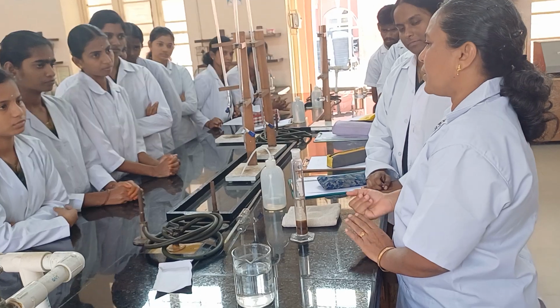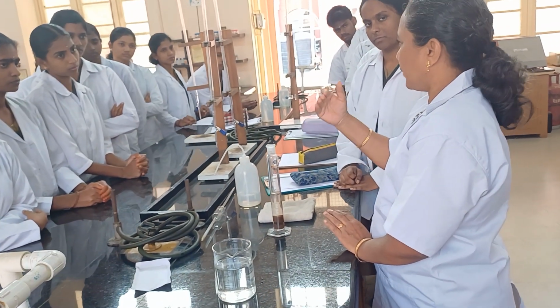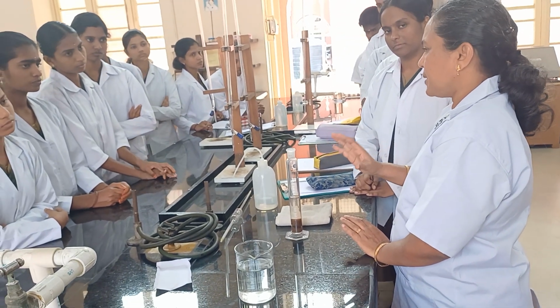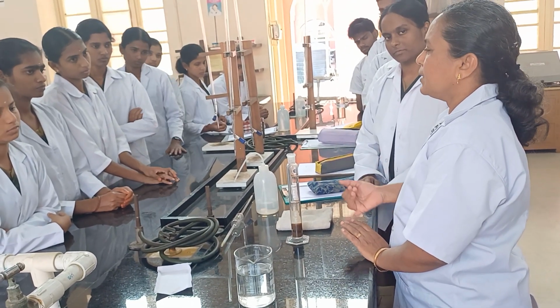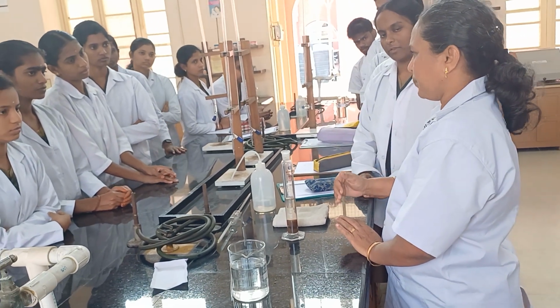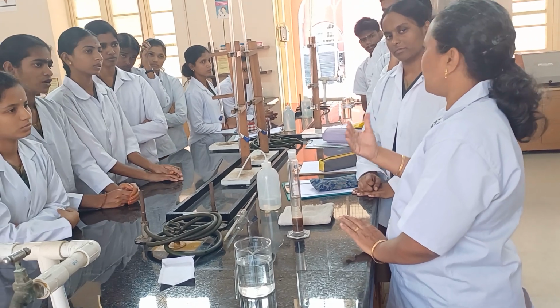The formula for bulk density is weight by volume. So weight of the soil, 20, by volume of the soil, V1, 17. If we simplify, we get the bulk density. Particle density is weight of the soil by volume of soil solids, that is volume of soil minus pore volume.